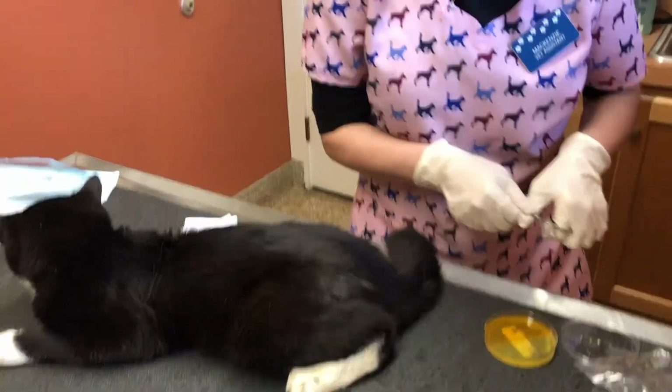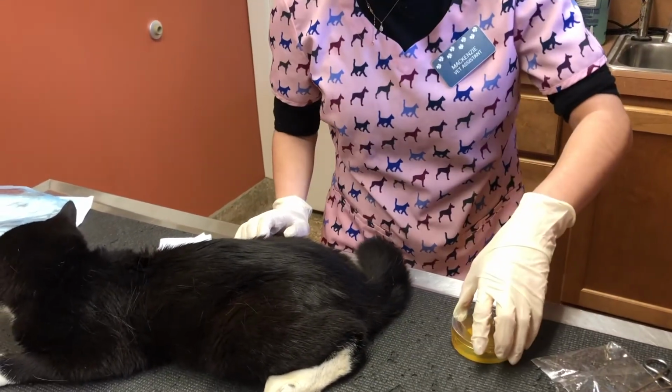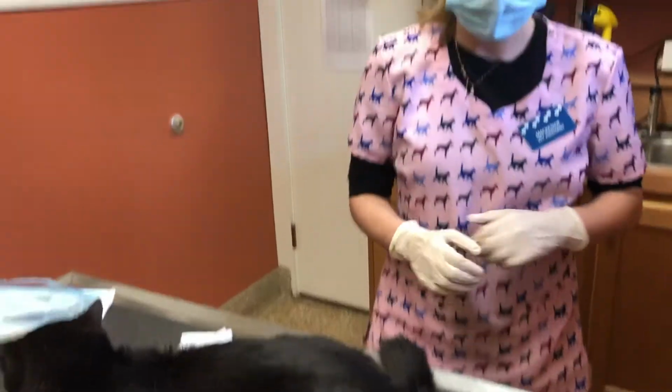And when I cover it, I'm not going to cover it tightly, so I'm going to put it lightly on so that it's not completely on. And I'm going to take my medium and let it incubate at room temperature, and I'll keep checking in to see if there's any growth or color change that would indicate a positive culture.